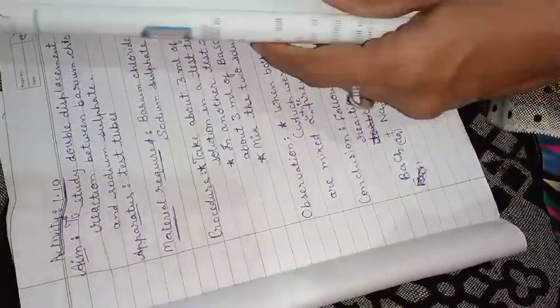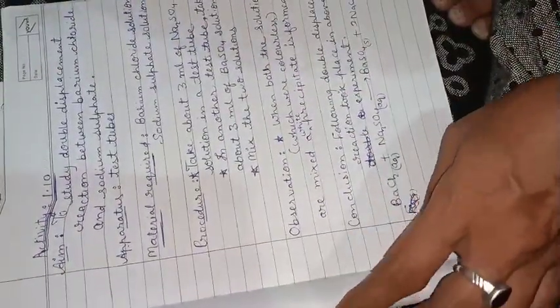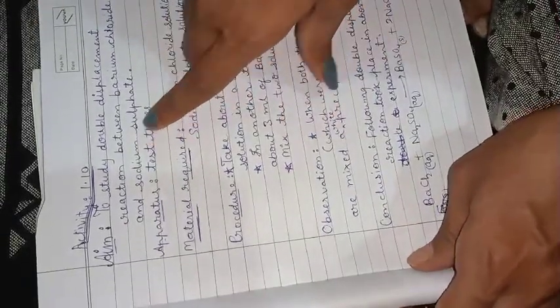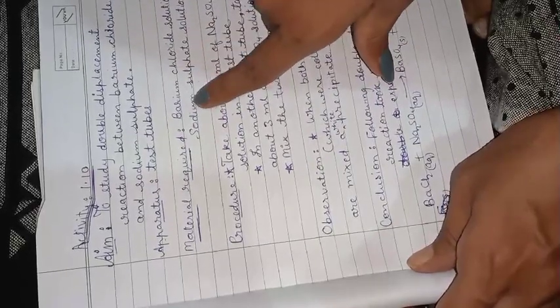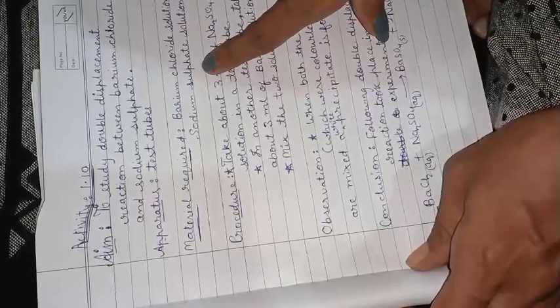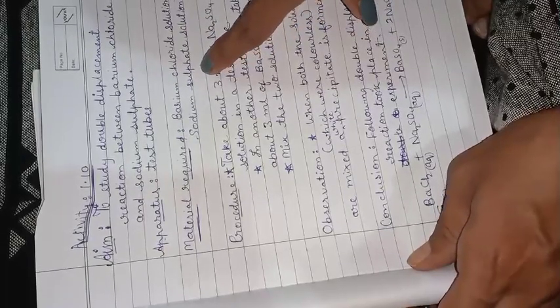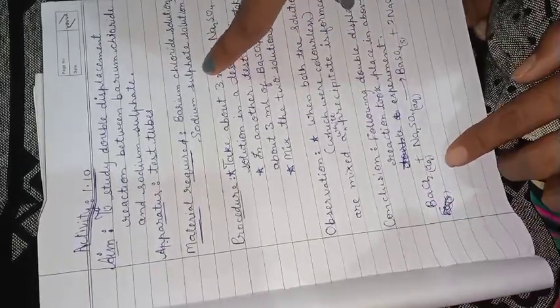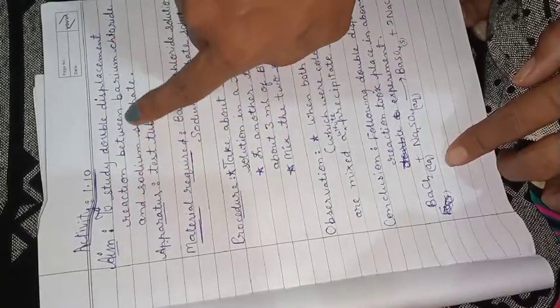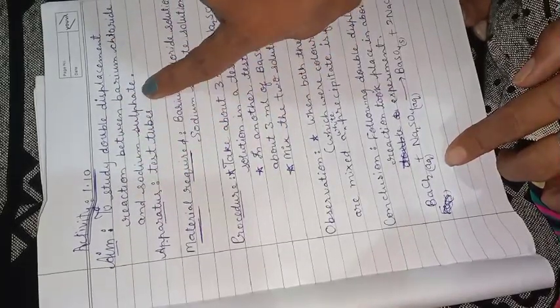Now our next activity, that is activity number 1.10, the double displacement reaction. In this activity we will mix two salt solutions. The first salt is barium chloride, the other is sodium sulfate. Both the solutions will be mixed and a double displacement reaction will occur in the test tube. So the aim is to study the double displacement reaction between barium chloride and sodium sulfate.